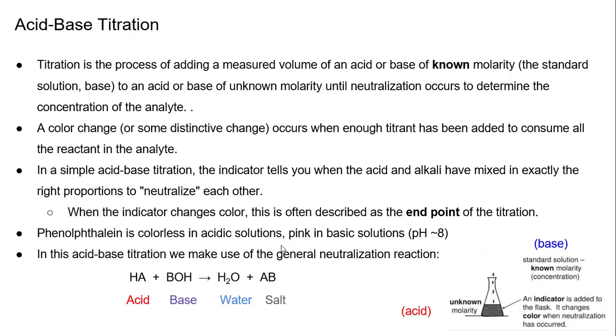Simply stated, you will be using a concentration of a known molarity. In this case, it'll be the base, sodium hydroxide, and your volume will be the titration amount that reaches the end point. That's your volume. You will have on the bottom an acid that you will not know the concentration, but you will have a known volume that you put into that flask. How will you know when to stop?